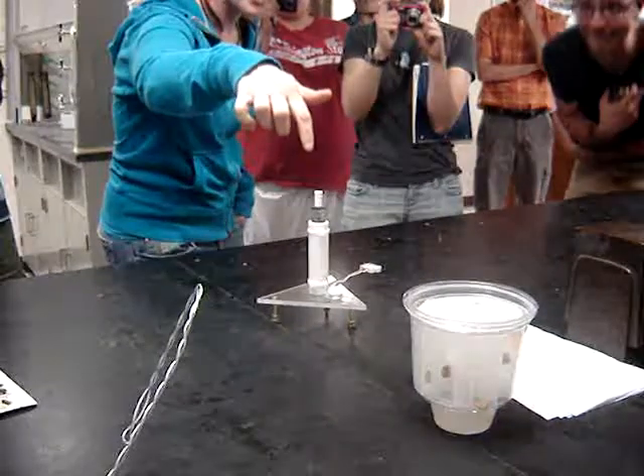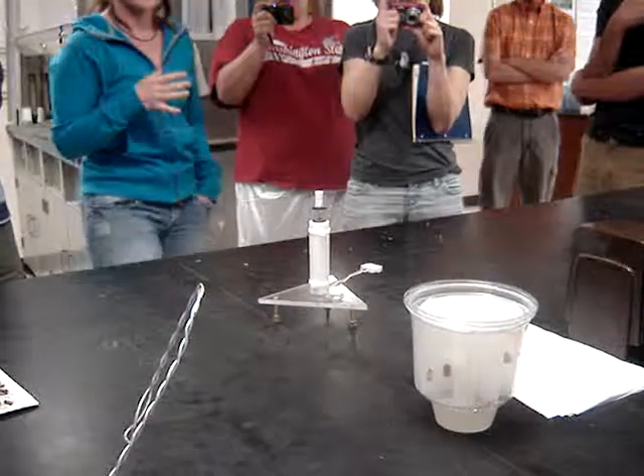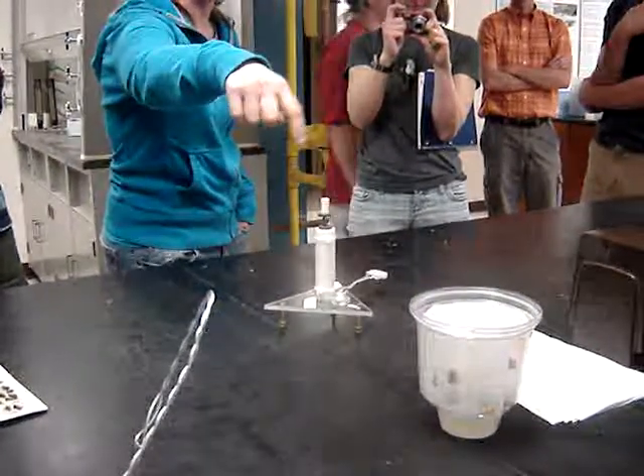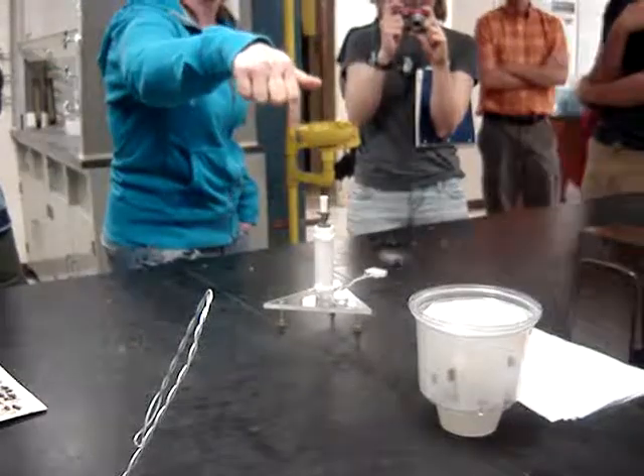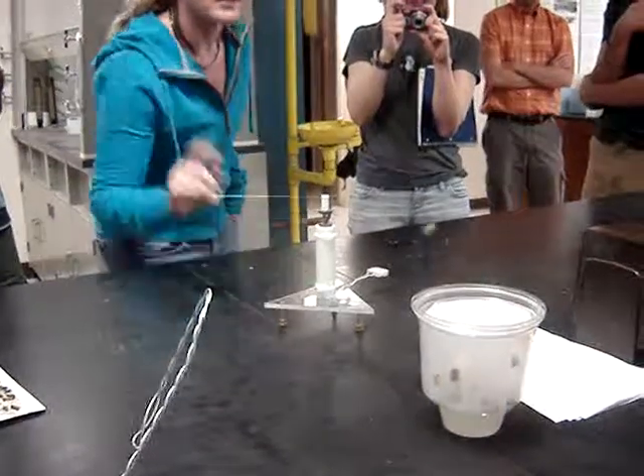The white barrier here is Teflon, which reduces the friction. And as you can see, these little tiny magnets on the side that are attached to two more insect pins go across this sensor — that's how it's counted.